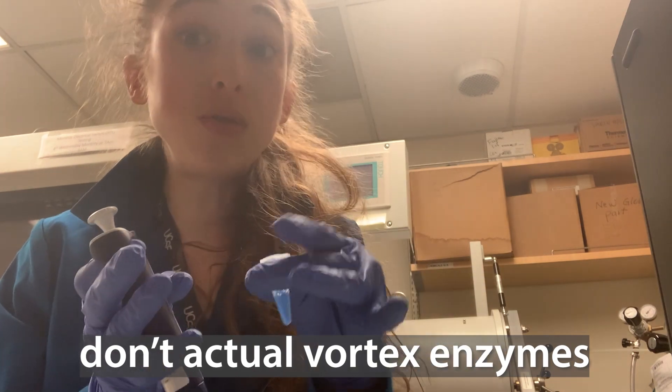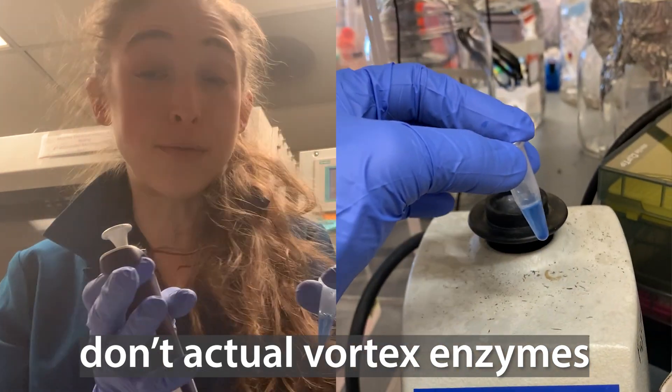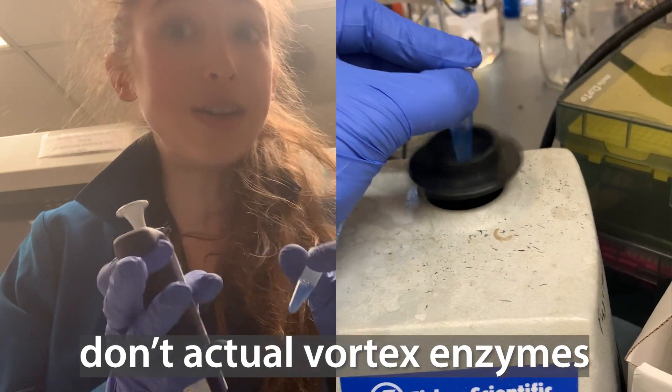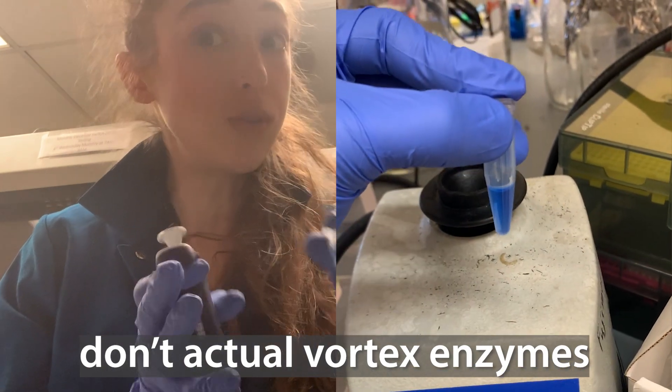If you have an enzyme though, you don't want to actually vortex. That vortex is going to mix things really well, but it can harm your enzymes. So don't do that.